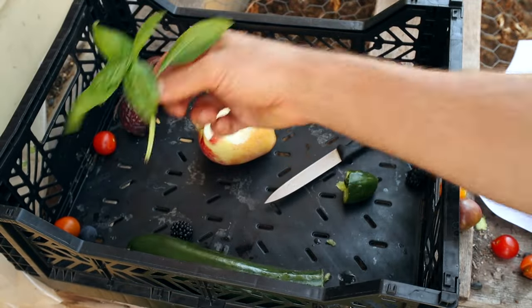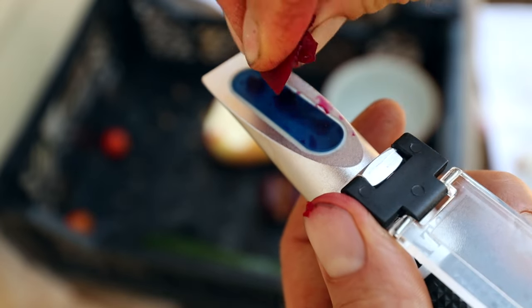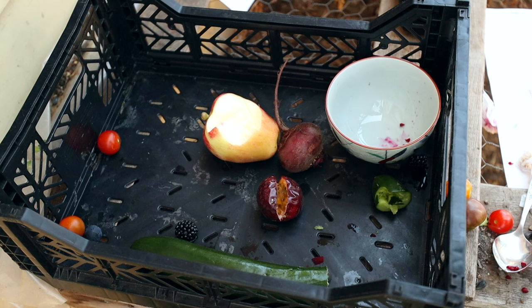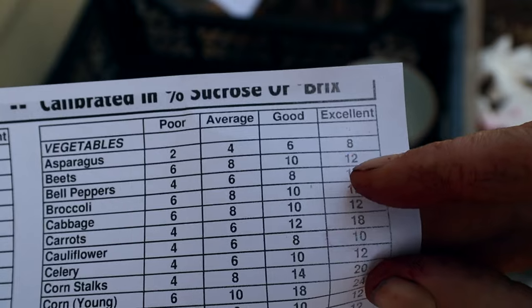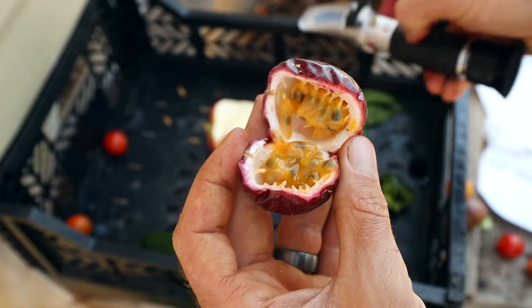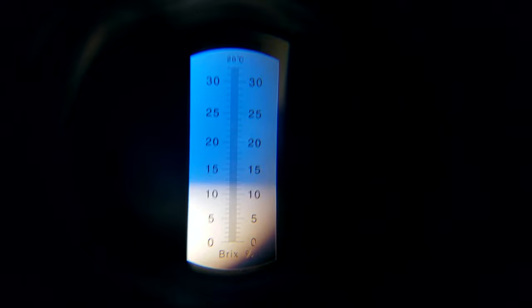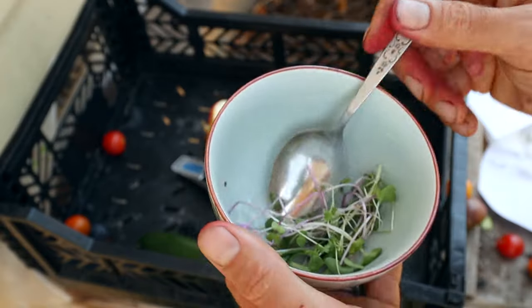We'll save our leafy greens for the end — let's do the beet next. The beet is sitting at 11 — where it's white it looks purple, that's the dyeing power of beets. So beets at 11 is almost excellent. I love my beets, they are super sweet. Now let's do a passion fruit — one of my favorite fruits of all time. For the passion fruit we got a reading of 12, which is good.